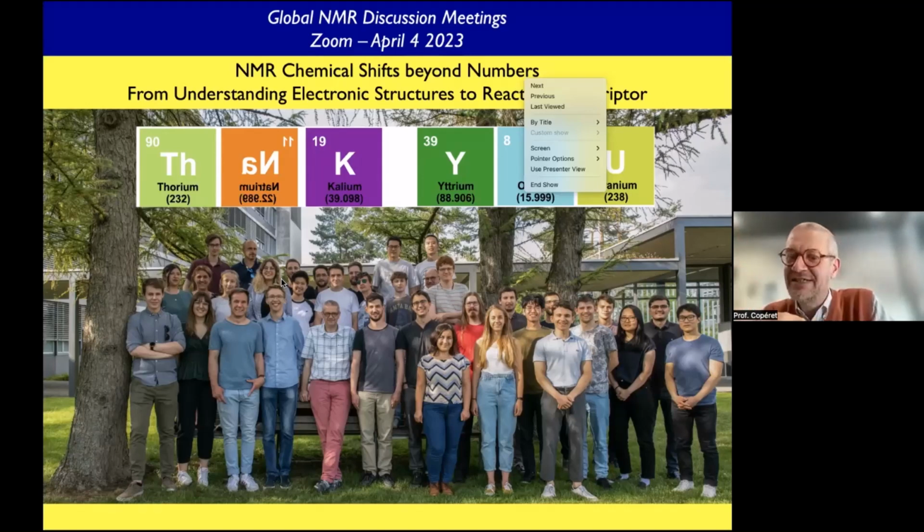Actually, all these studies that I discussed today derive from the PhD of Frédéric Blanc, when we were looking at the time at CSA, but we were mostly interested in dynamics. So we used CSA as a way to measure dynamics, and then it matured 10 years in my mind to look at CSA to understand electronic structure. So if you have dynamics, you average everything, and what you measure is not reality.